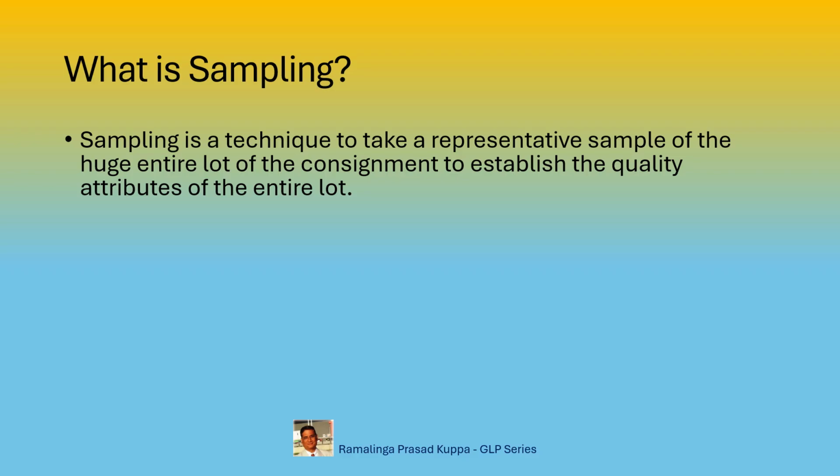The sampling technique should be scientifically designed. Generally, a military standard MIL is adopted for the purpose. Root N plus 1 is one example.